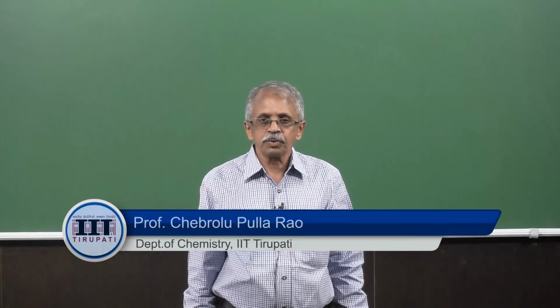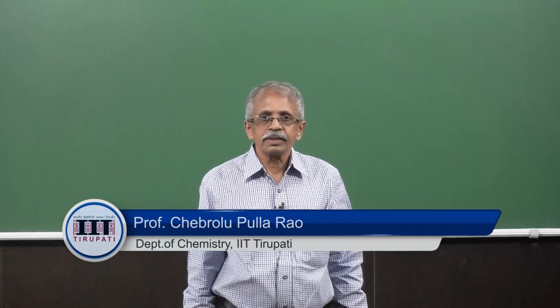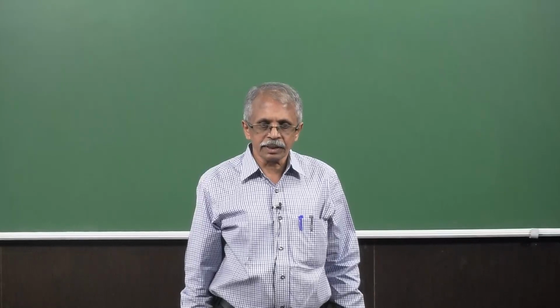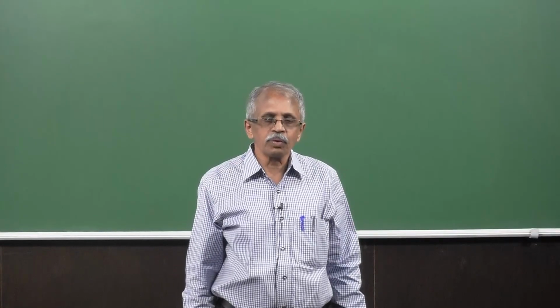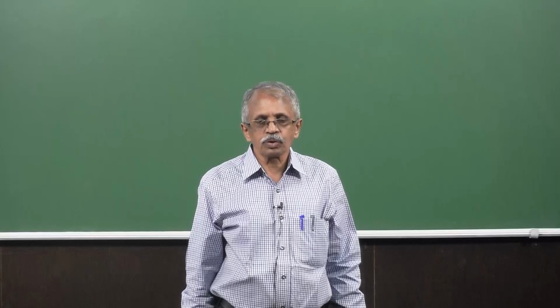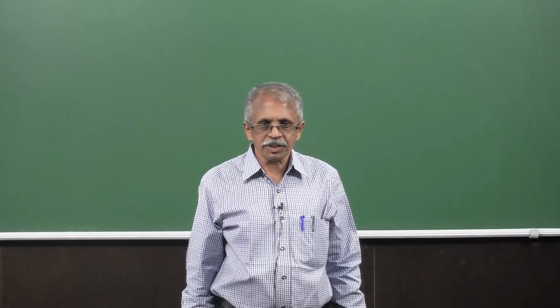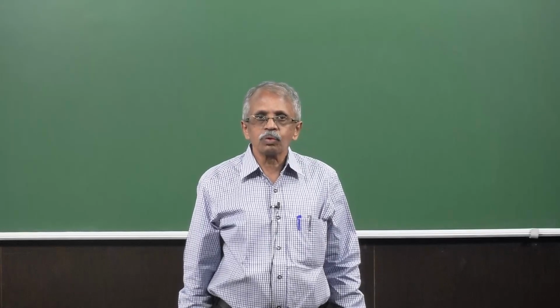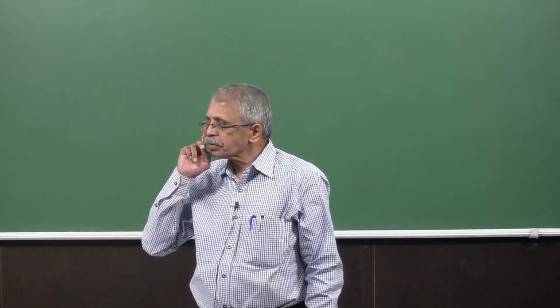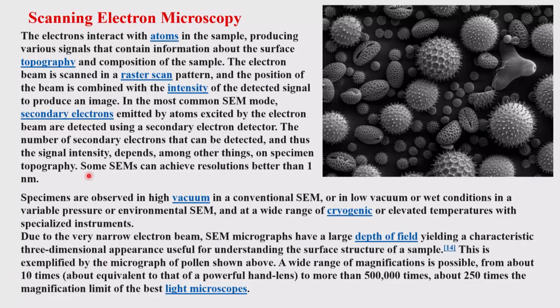Good afternoon. Welcome you all to the next lecture in this particular course on analytical, spectral and microscopy applications of inorganic compounds and nanomaterials. For the past 4-5 classes we have been going through the aspects relevant to the microscopy. We have looked at the atomic force microscopy, then transmission electron microscopy, and we just began to look at the scanning electron microscopy. So, I have already mentioned to you in the scanning electron microscopy, you measure secondary electrons, you also measure backscattered electrons, and then you can use combinations of these things to generate the pictures.